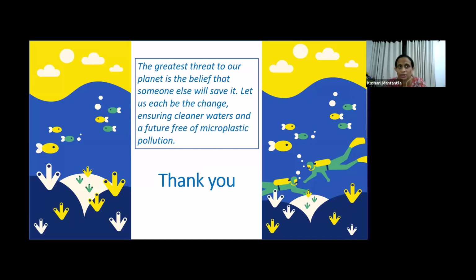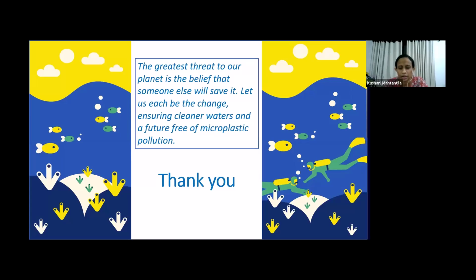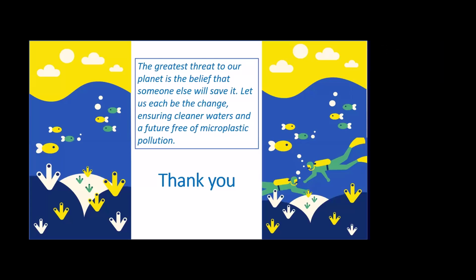In that case, we can use that filter. NIOSH recommended some pumps that are available.